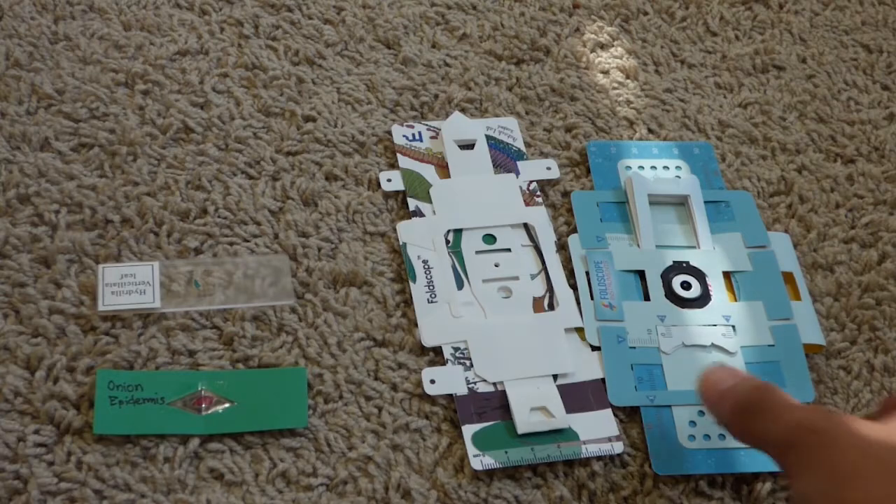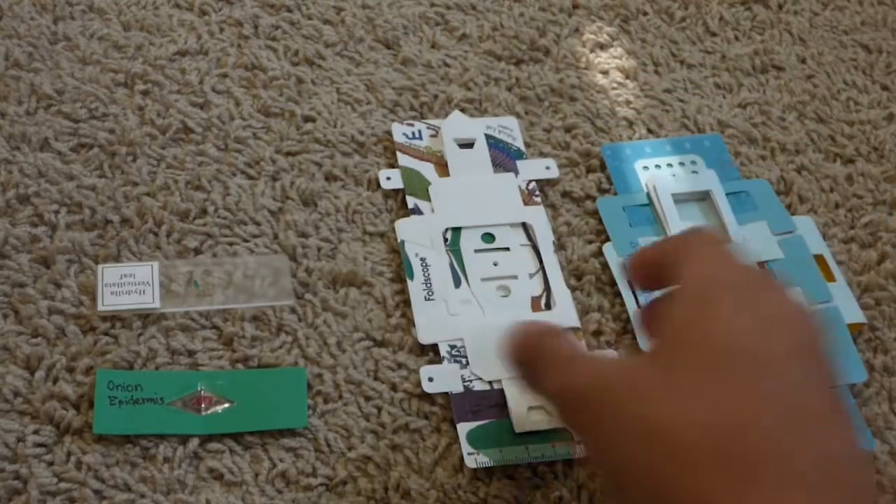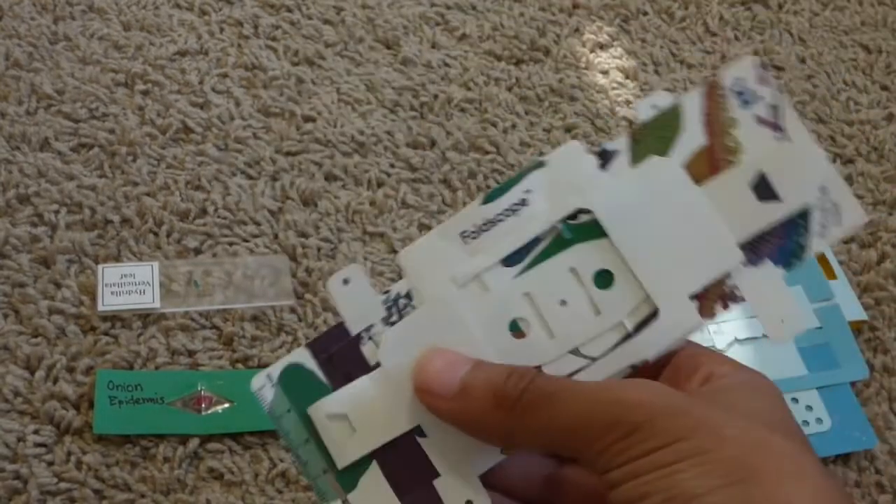First off, I'm going to look at the slides through this more recent version of the Foldscope, but we'll also be taking a look at how to put them in the older versions of the Foldscope, like this one here.